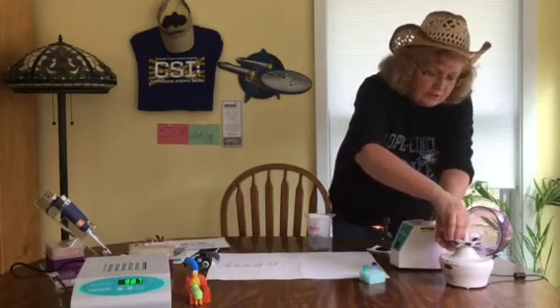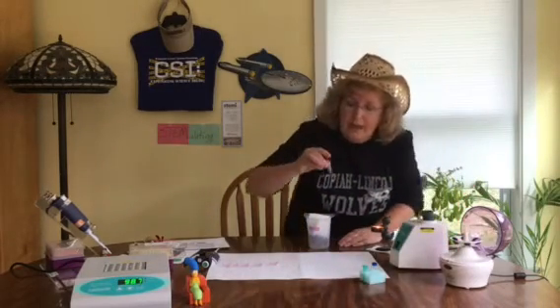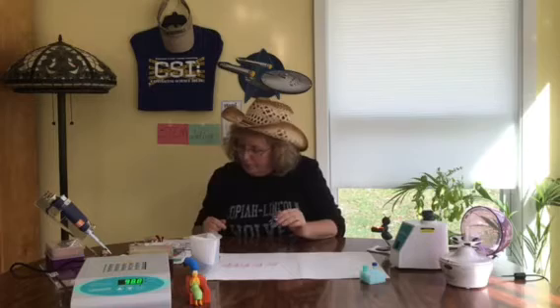As I pull this out, this is the one with the ant. I can see that there is a pellet that has formed at the bottom on the same side as the hinge. I can see the exoskeleton. Remember, what you want is the purified DNA found in the supernatant, sort of like Superman flying up at the top. How much do you need to get? You need 50 microliters. Avoid the pellet of Instagene. We do not want Instagene to go any farther than this step.